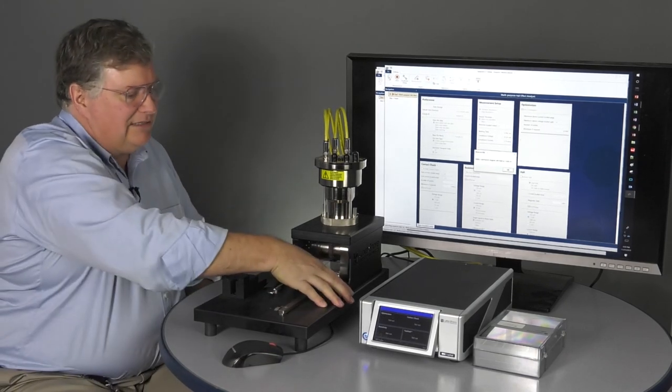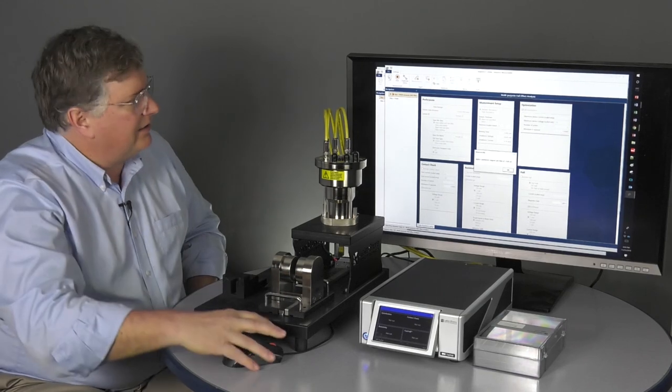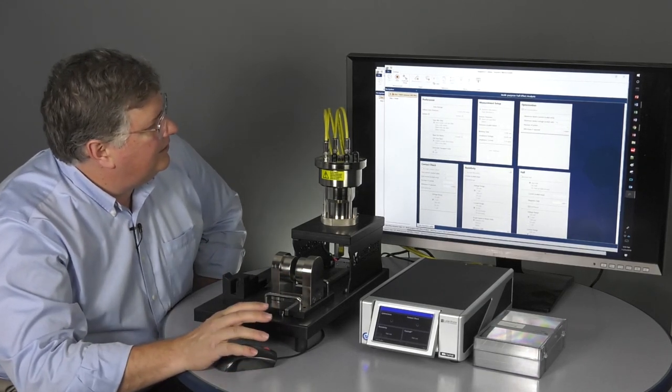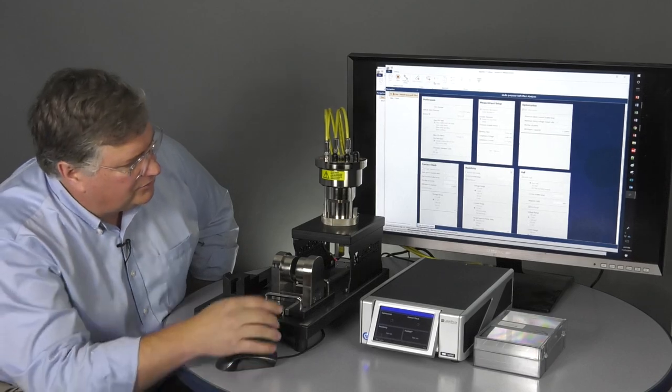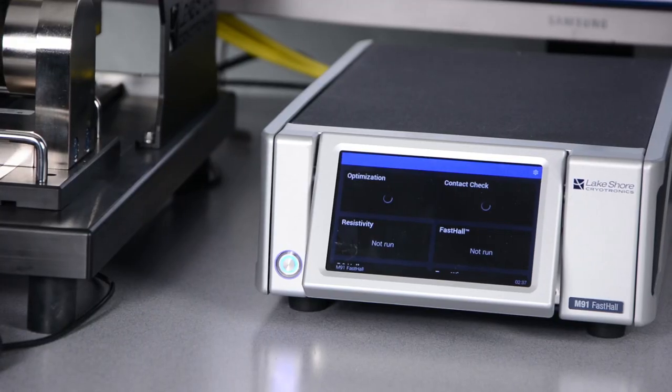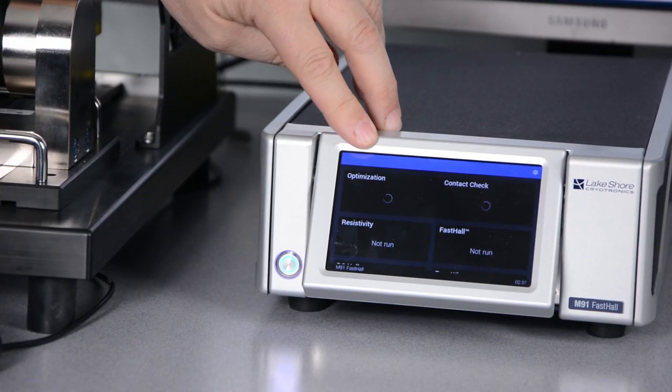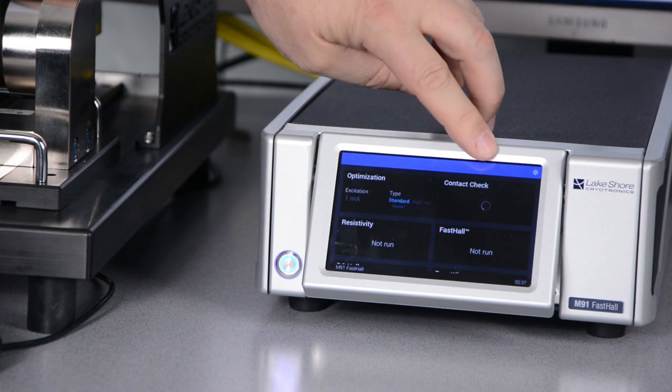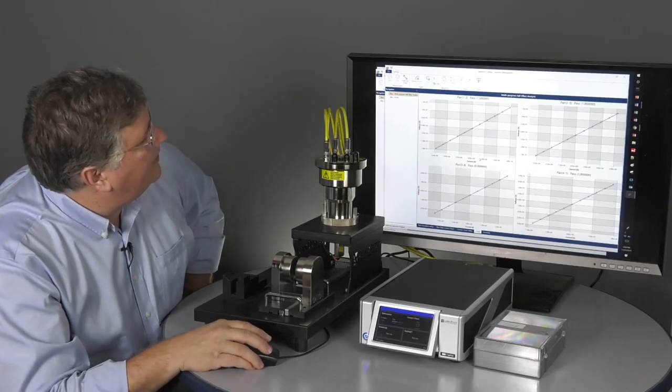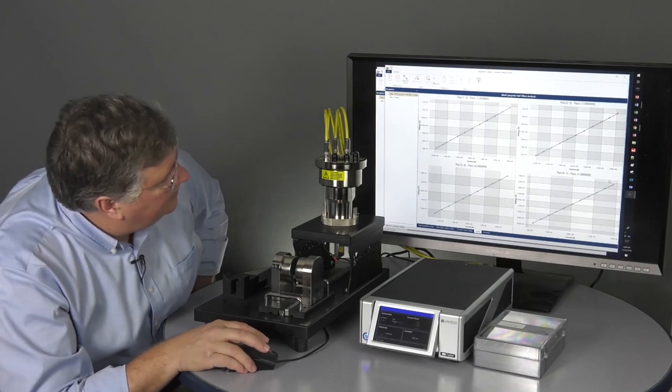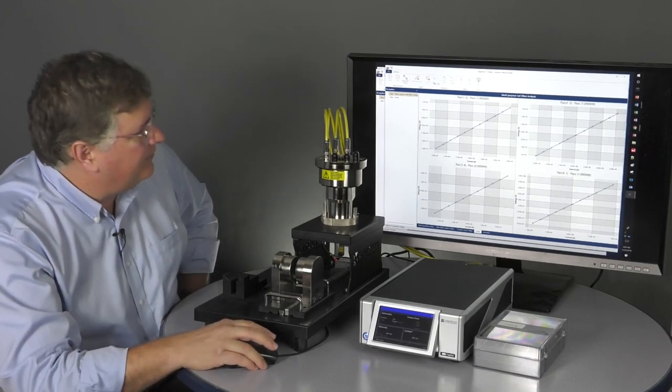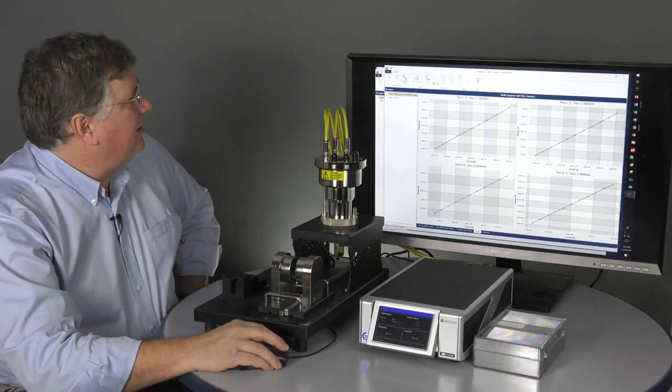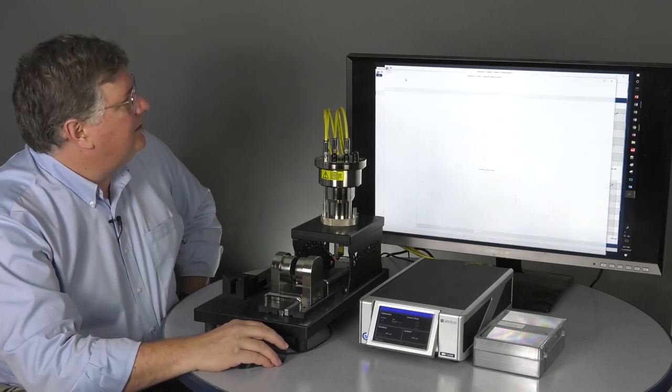It's asking me to go ahead and put the magnet back in zero. Forgotten to do that last time. And it's running the optimization and looking for contact check. So I've got good, good, good, good. You have perfect sample. We're pretty much ready to go here. That looks excellent.